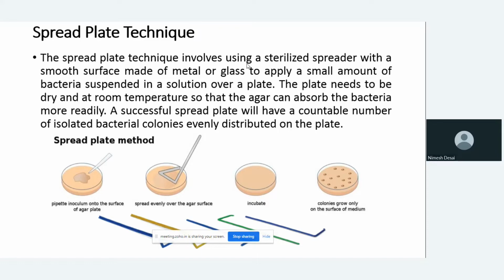What is the difference between past and future microbiology laboratories? In the past, there was a lack of inventions. We were using glass spreaders and glass Petri plates. We needed to autoclave them. We needed to prepare the media in-house, everything. So it would take a longer and longer period of time.